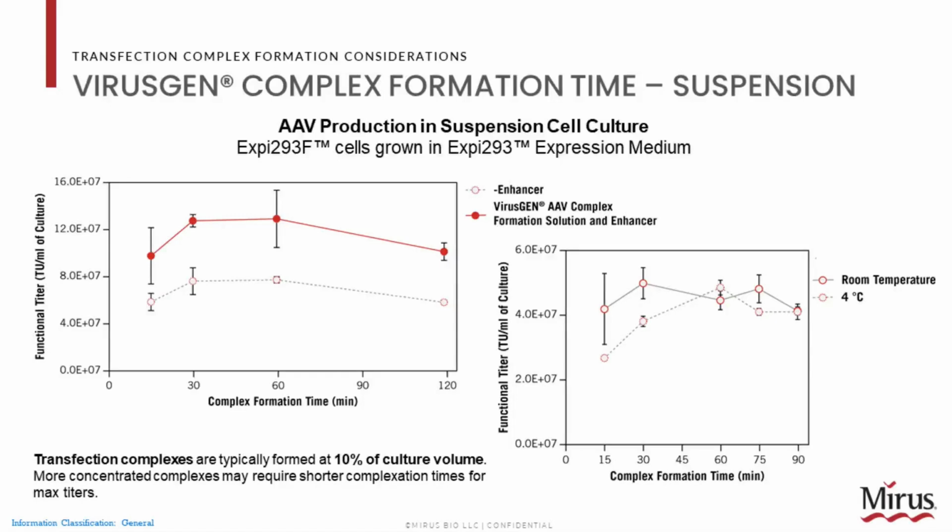As we noted before, once the reagent and DNA find each other, they're going to start to complex. And as this happens, we are going to have a window of time for optimal transfection. For VirusGen, that window is a very open, wide time frame of 15 to 60 minutes. So this allows for a lot of flexibility in where our complexes form. Again, we could form this in a buffer prep area versus the dedicated upstream suite. The time to make and verify those aseptic connections. Welding can take a few minutes per line, verifying the connections.